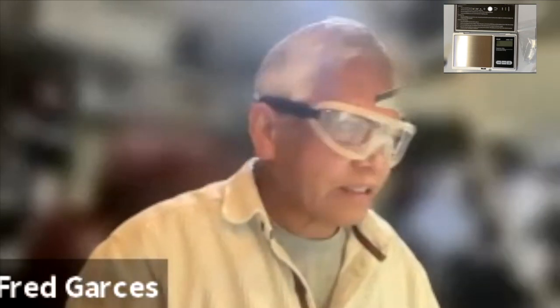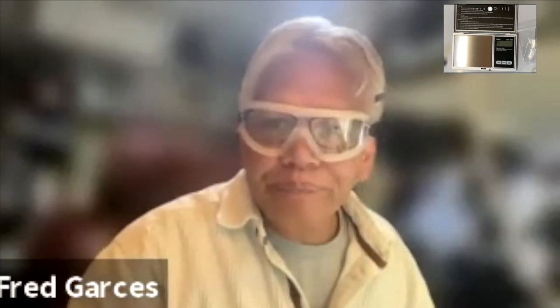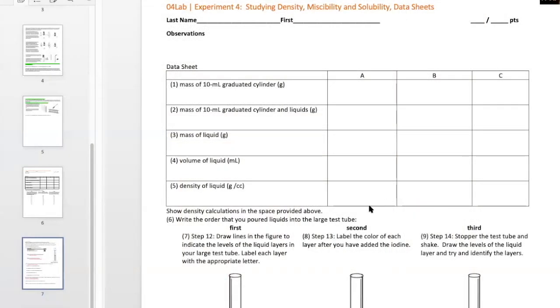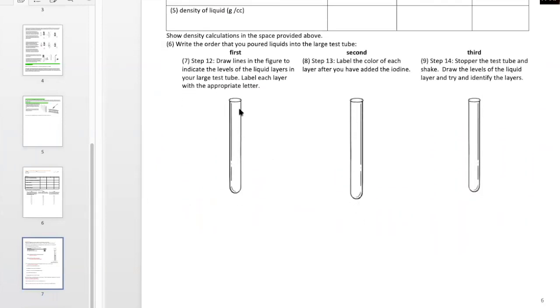What you need to do next is just answer the post-lab and put the data in the data sheet. Let me show you that real quick. Put your data on the data sheet here. Okay. Draw a line to indicate the levels of the liquid. Before you mix, draw a line. Which one is A, which one's B, which one is C? Maybe C was on the bottom, maybe B was on top, and A is in the middle. You have to indicate that.